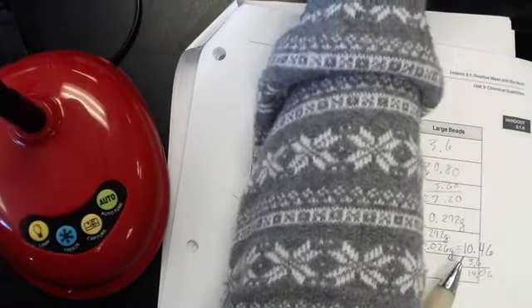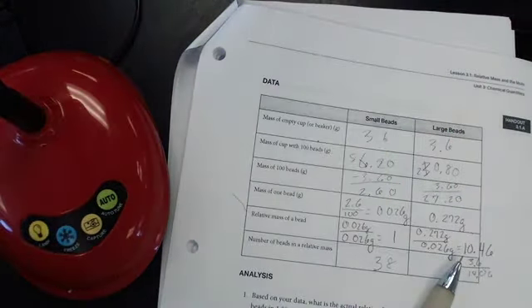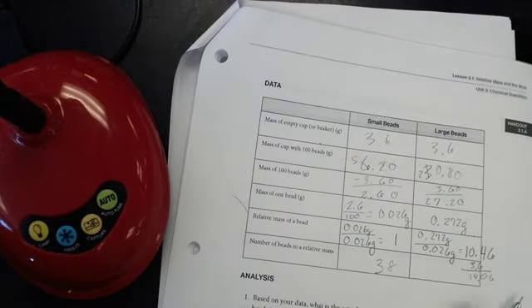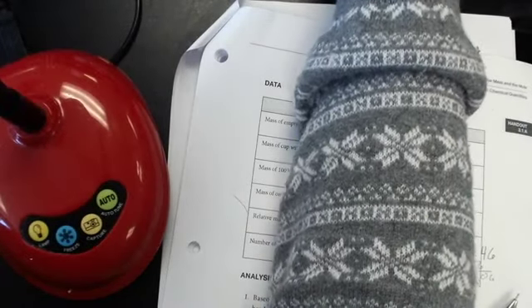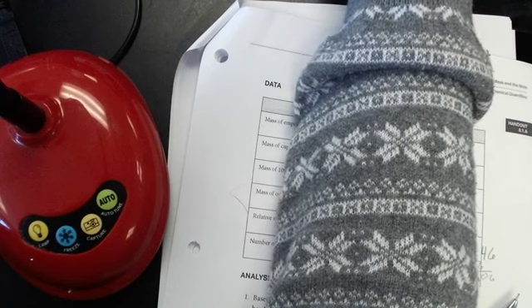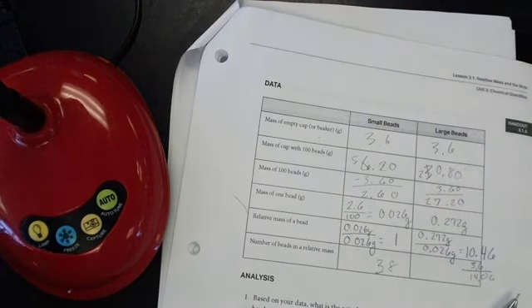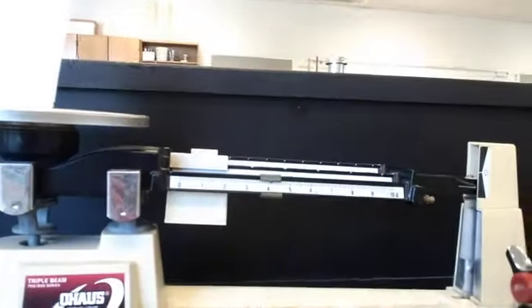So I'm going to go ahead and set this to 14. Well, I can't do 14.06, so I'm just going to do 14.1. Okay. And then I'm going to count the amount of beads that it takes to achieve that mass.